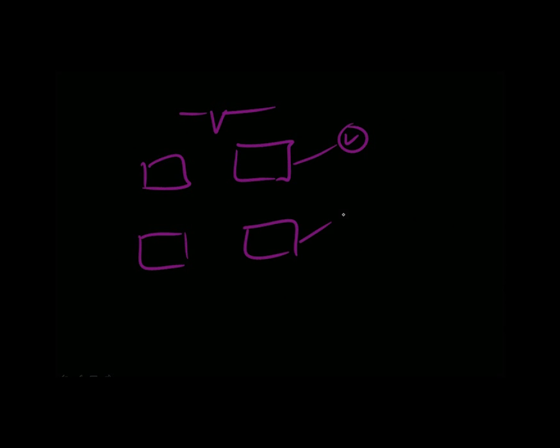So again, we have our tip, and you can imagine, I know, this is a bad drawing. We have our extraction, and then acceleration.